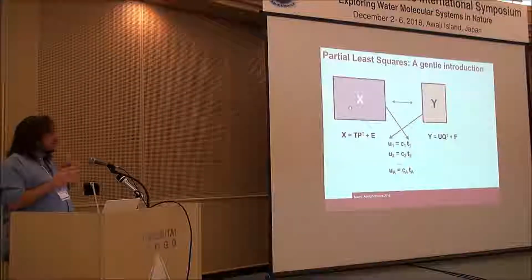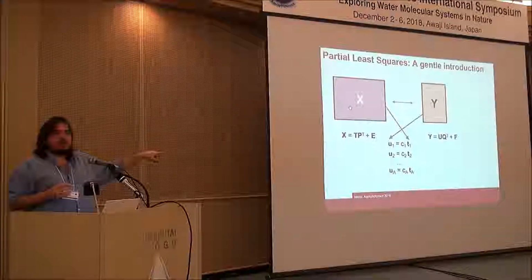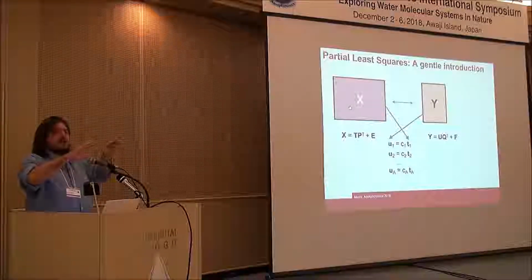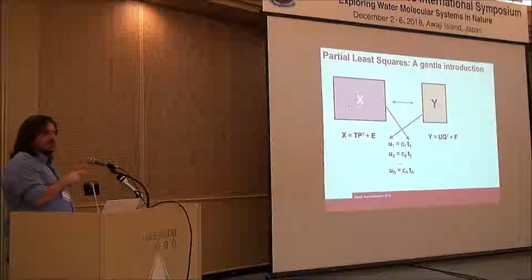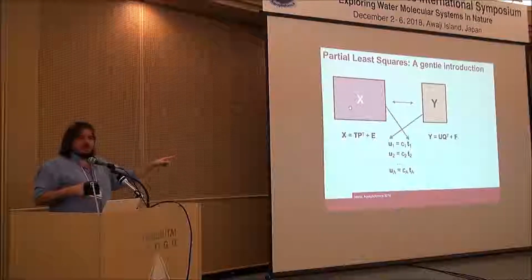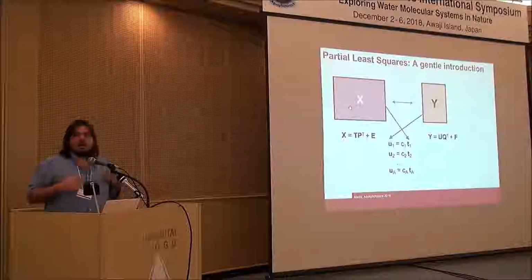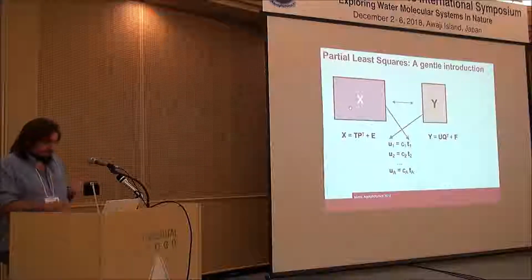So what makes PLS a linear model is that particular inner relation, not the overall part, because I have two linear projections for scores. What makes it a linear regression model is exactly this part here. It is also the part where I can act when I think that my prediction need not be linear anymore.